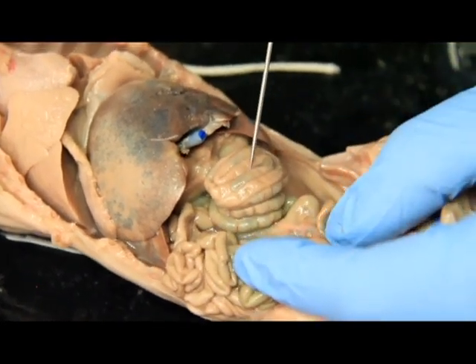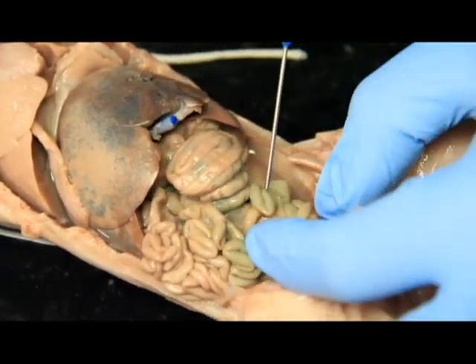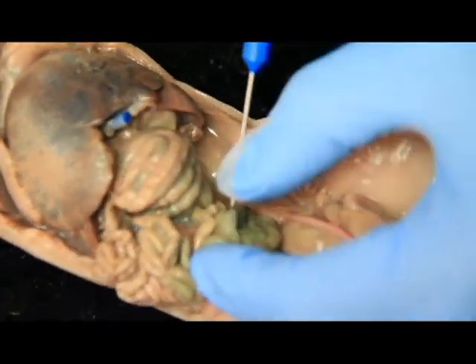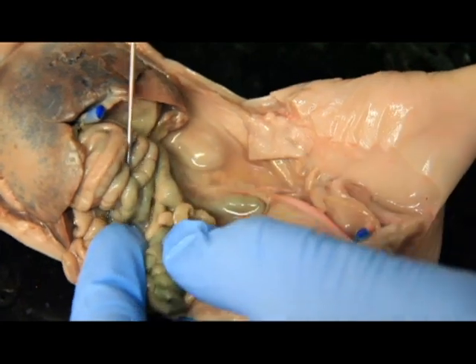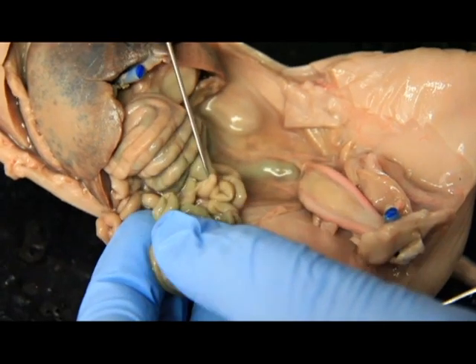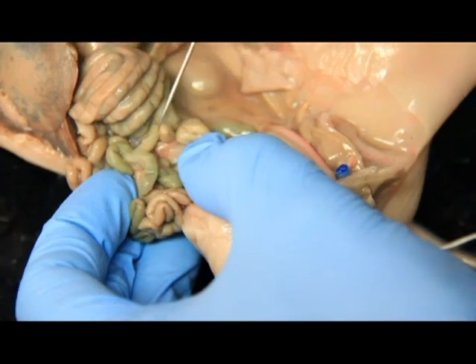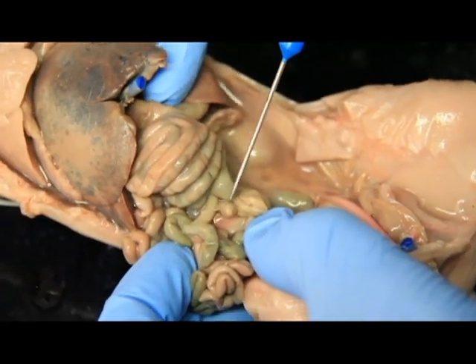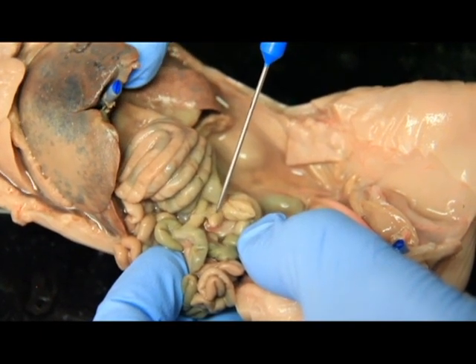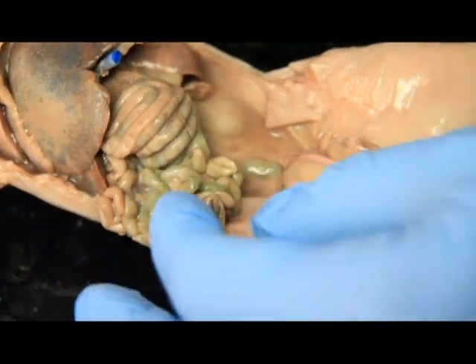And right in between our spiral colon and our ileum, it's going to be a tiny little dead end. And that tiny little dead end finger-like projection, let's see if I can find it, there he is, right here. You can see how it's the only dead end in all of this intestine. So it keeps going and keeps going, except this little finger-like end point right here in between the ileum and the spiral colon, that's our cecum. Very small and kind of hard to find, but if you look right there, you can see this little dead end finger guy. That is our cecum.